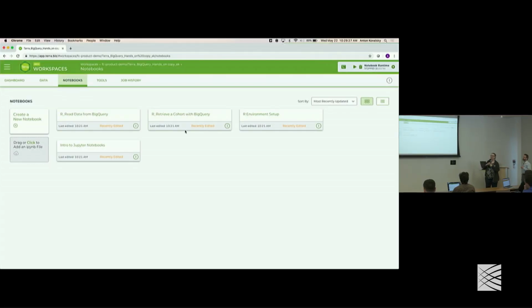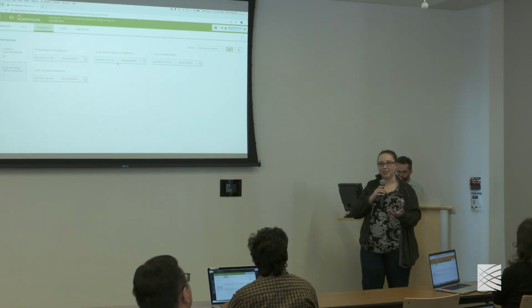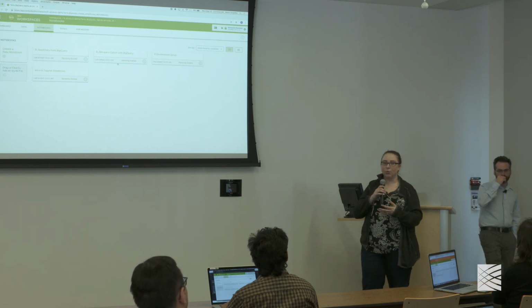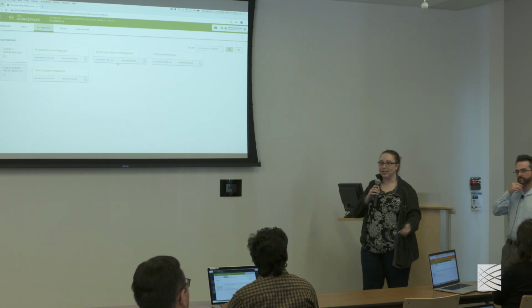Okay, so what we just did was clone a public workspace so that you now have access to everything, to edit it, to run it, and Anton will walk you through that in a second. But I just wanted to tell you what we did with that billing project. Everything in Terra, there's no cost to use Terra, but there is a cost to use Google's resources. So in order to do that, you have to be tied to a billing account. Many of you are new users, so you had free credits that you were able to use. Those free credits will expire in 60 days, or if you use, I think it's $300, whichever comes first. So that's to get you started.